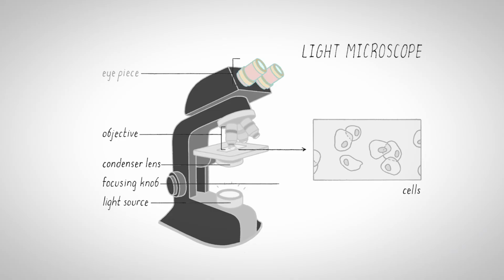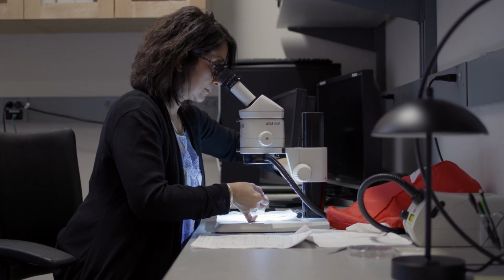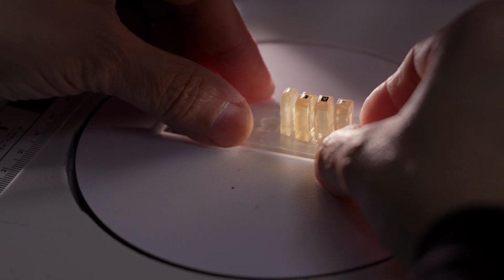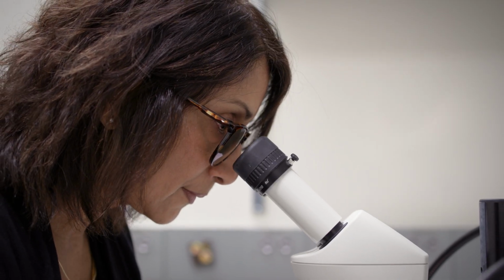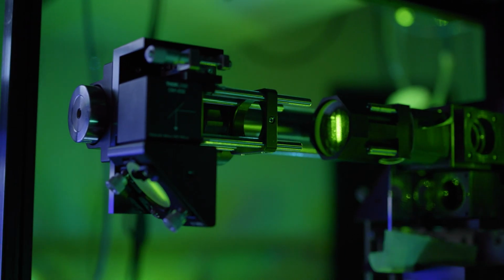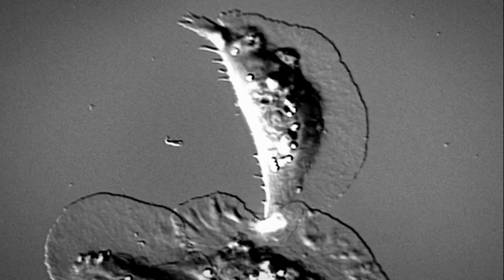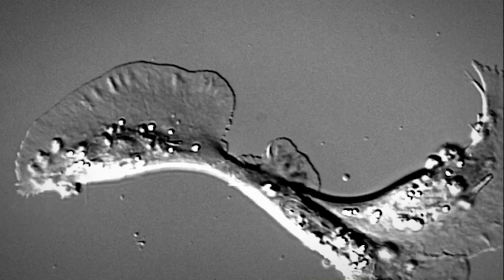The light microscopes that we're most familiar with all use eyepieces to observe our sample. And in the early days, fantastic scientists like Santiago Ramon y Cajal would look through the eyepieces for hours and intricately draw everything that they saw in the microscope. Now, modern microscopes have supplemented those eyepieces with digital cameras so that you can record images in 3 dimensions or even over time of your sample as it's growing, moving, dividing, or doing all sorts of things.